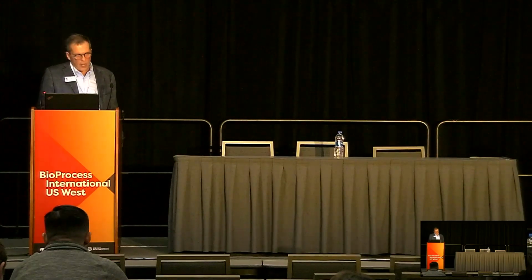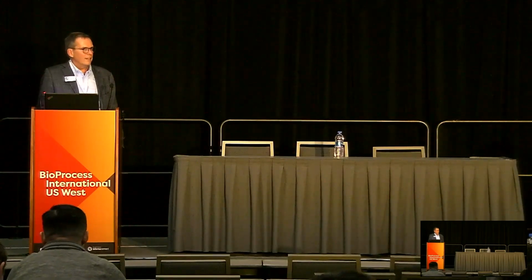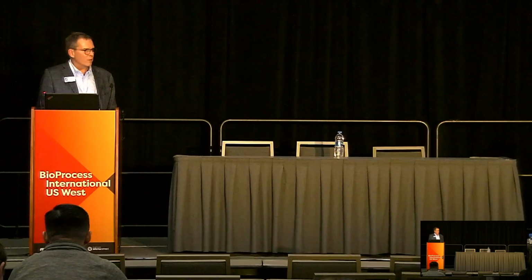Very, very good question. Yeah, we're blessed actually because we're just outside of Purdue University, and two of our multiple patents are licensed from Purdue. So we have a nice arrangement where we can do confirmatory tests on very big, powerful mass spectrometers and other technologies, so that we don't end up barking up the wrong tree, right? We don't want a bunch of people trying our product and saying, well, wait a minute, this doesn't work, and I'll prove it to you. We've gone through that effort, and with some of our investors' funding we did invest in mass spec as well, so that we can do very quick tests without running over to Purdue every day.